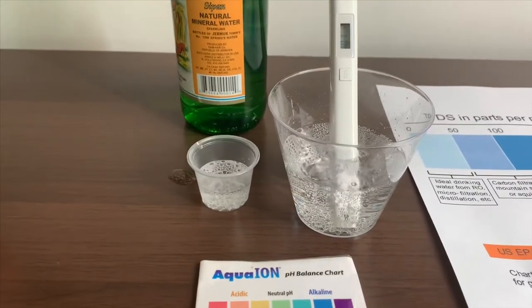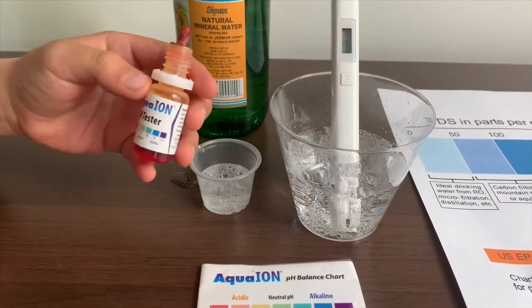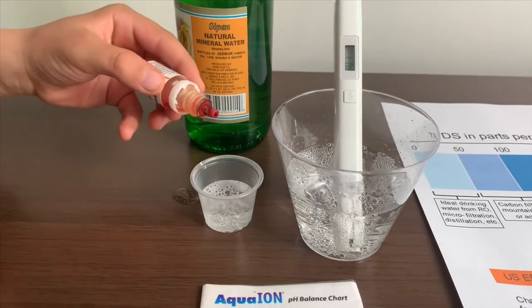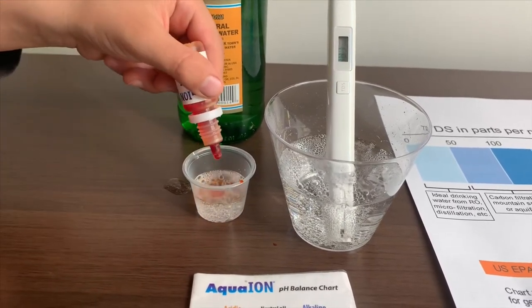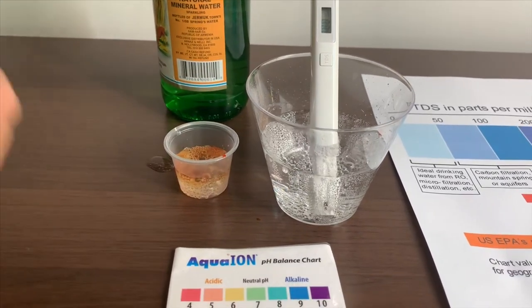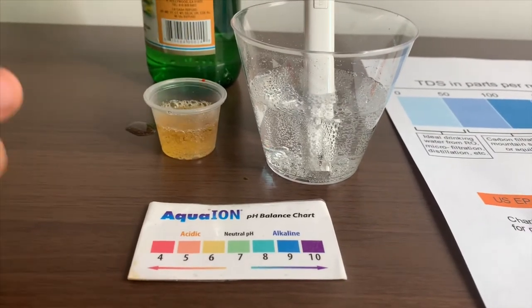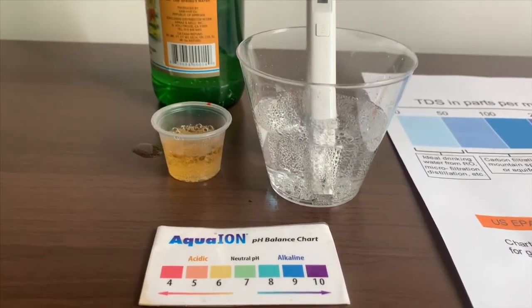Now let's test the pH level. If you want to buy this pH tester, check the link down below. I'm going to do two drops. Let's stir it for a better result. The reading is 6 — this is a neutral pH.